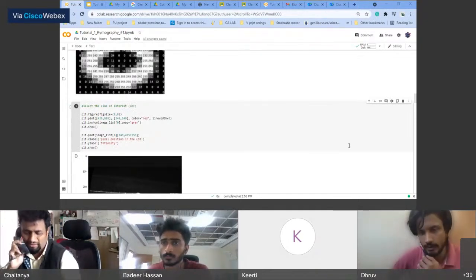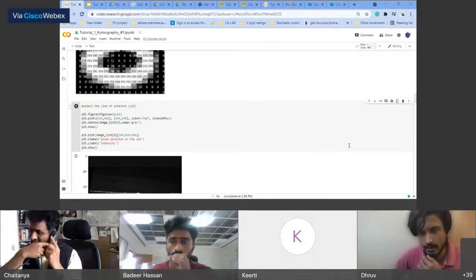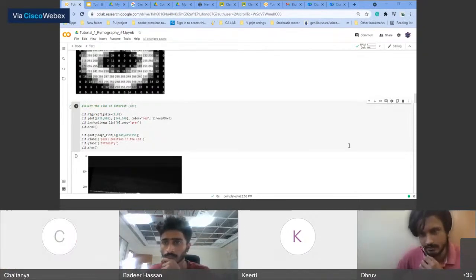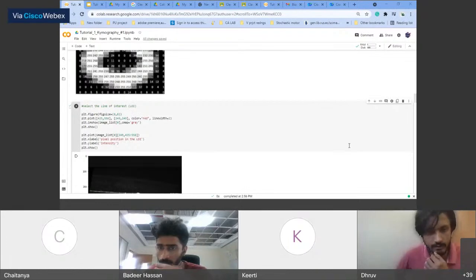When I'm coding in Python or in MATLAB, I can just show the image, and there's a function called ROI select. You just type it and then you can select a specific ROI, so you don't have to leave the coding framework. Yeah.